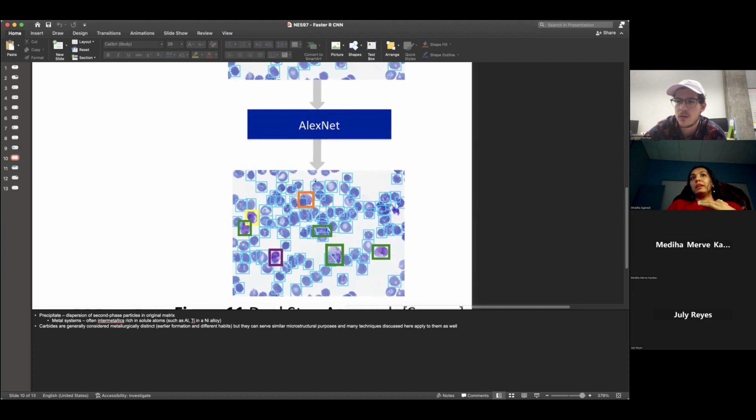Yeah, because normally the backbone of faster RCNN is already inspired by AlexNet, VGG, or GoogleNet, or by different things. So just applying it 2 times seems to me a little bit not well understood, because these YOLO or faster RCNN are quite robust in doing analysis for the most part.